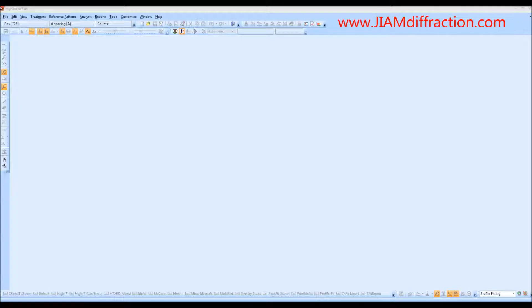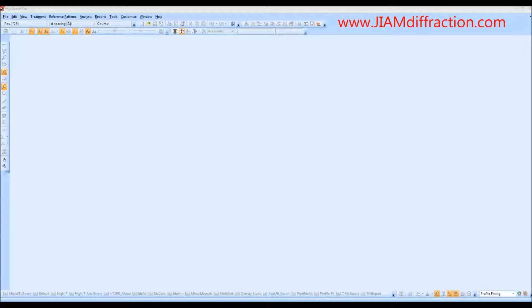If you are unfamiliar with HighScore Plus, it may be a good idea to stop this video, watch the phase identification video first, and then return to this one. For those of you still watching, we will now look into how to determine crystallite size and microstrain. These properties are determined by the breadth of your peaks, so we need to first determine the broadening caused by the measurement optics before analyzing data from your sample of interest.